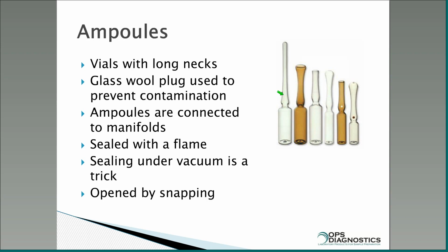So your sample is placed in here. You put some cotton, or it's not cotton, that will burn. You put glass wool in here that's been sterilized, and then you freeze this. This is put onto a freeze dryer port, and you pull a vacuum and it will dry. And again, there are some tricks to that I'll get into in a minute.